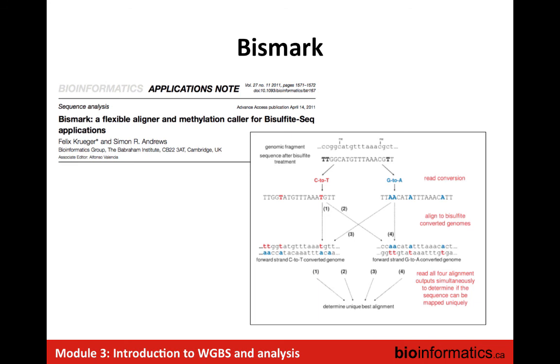So the Bismark tool takes that complexity out of your hands. It does all of that work of converting the reads and mapping them. But I think having an understanding of what's happening under the hood is useful. There is a real limitation here, because we're working with modified reads. They no longer just map to the reference genome, so you need to take that into account.